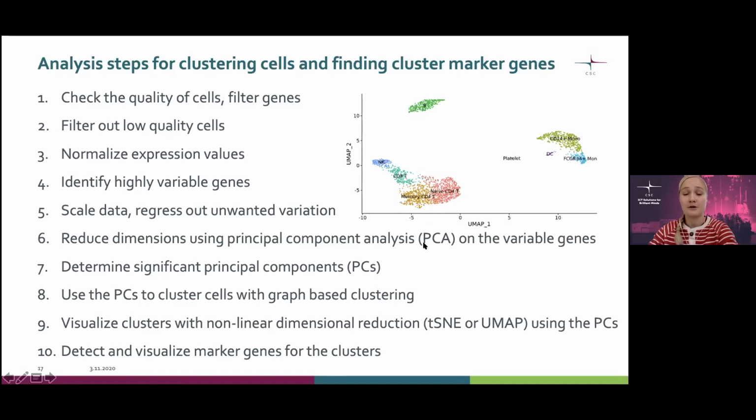And you will learn a lot about different dimension reduction methods and about clustering, especially in this type of analysis. All these steps and topics are covered in small sections of the course. Each will have its own short lecture video demonstrating these things, and then you get to exercise those using Chipster in the exercises.